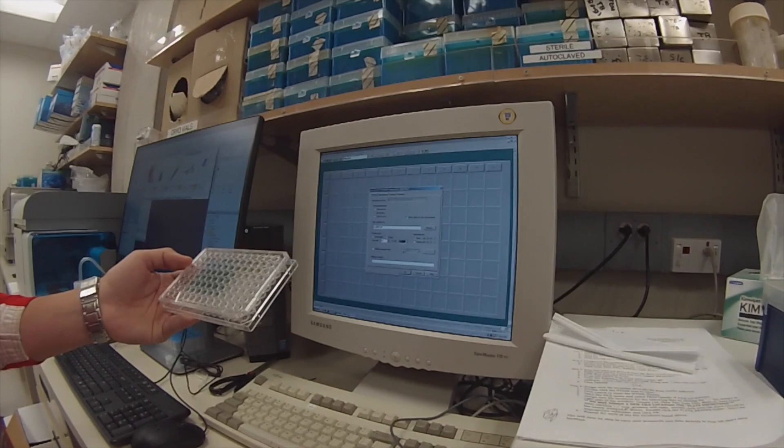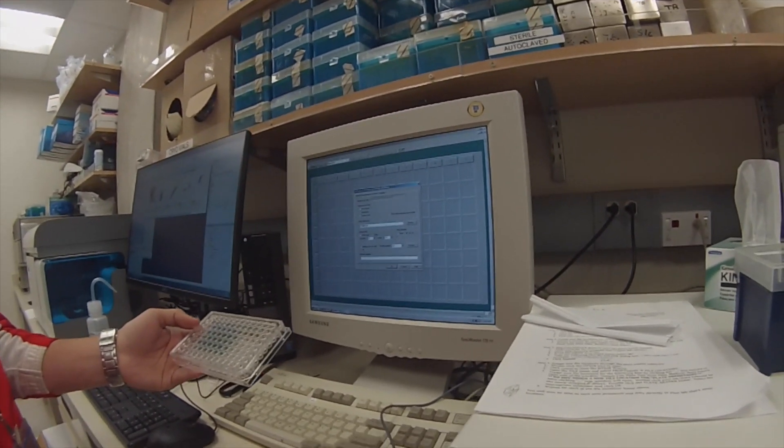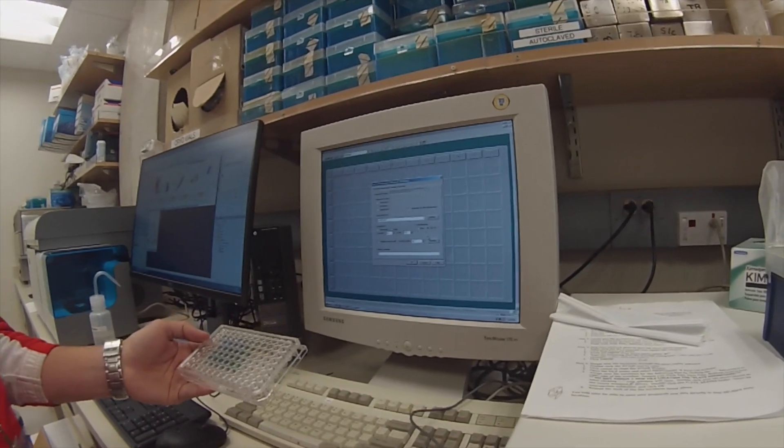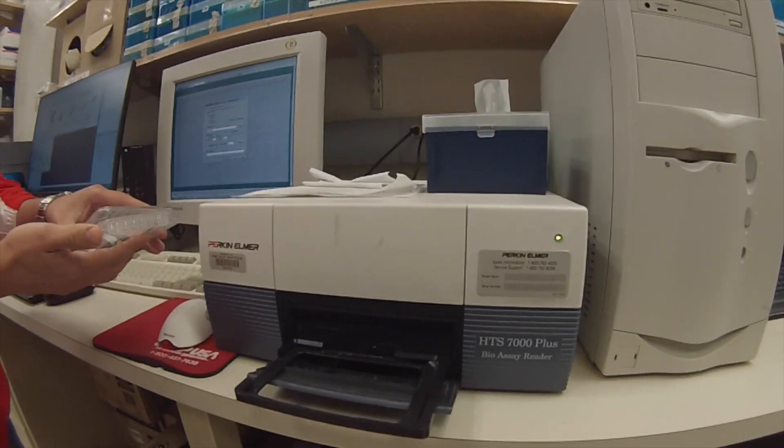We also want to do multiple reads per well and we have the reading pattern as two times two. Then we're going to put the plate in.